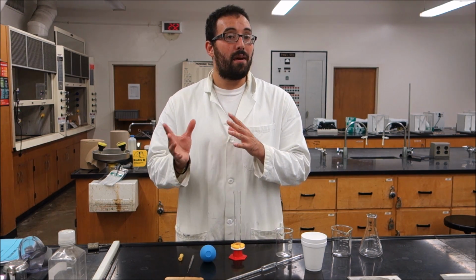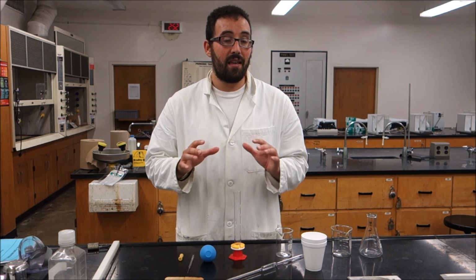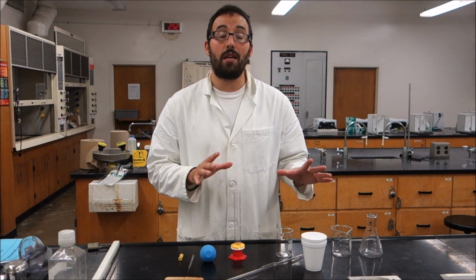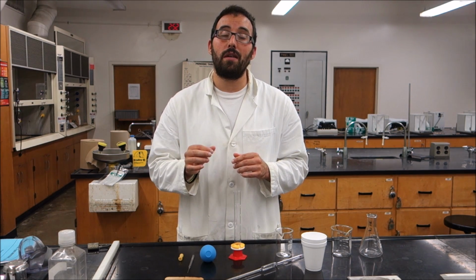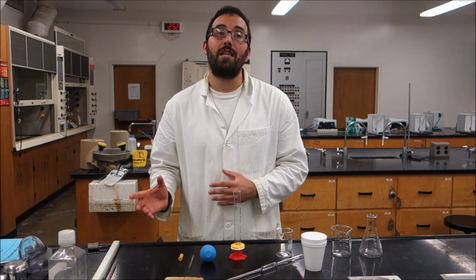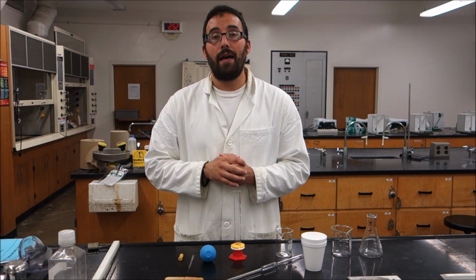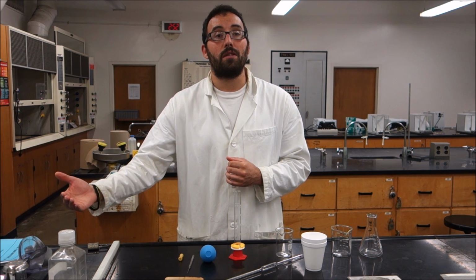Aside from that, I can't really give you that many hints, but again, think about your transport containers, think about the samples you're going to be using, their specific heats, how much heat it takes to actually heat them up by 1 degree Celsius, as well as what you have available to you.